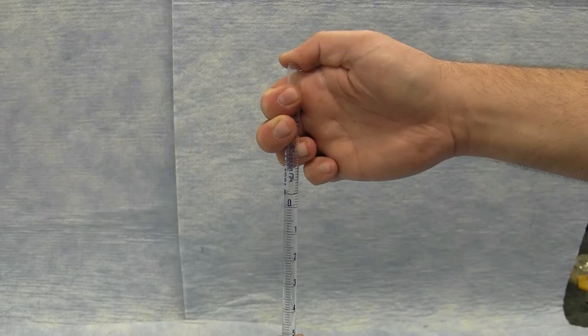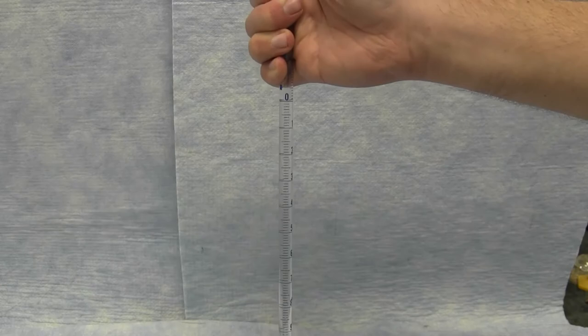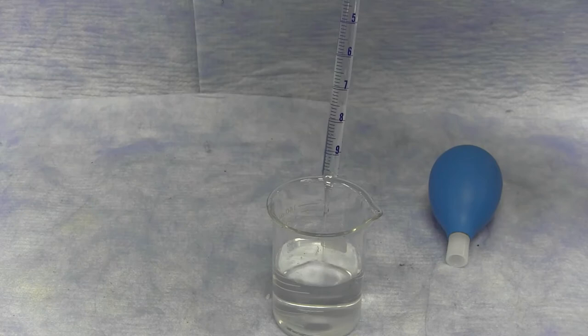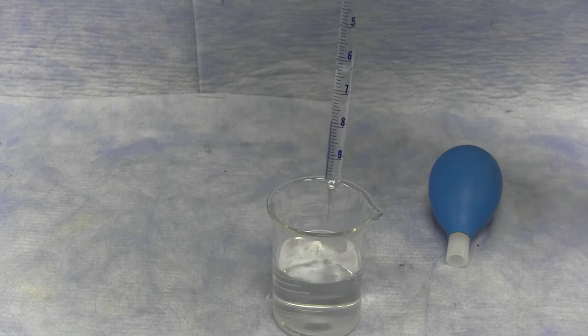You can then transfer the liquid to the appropriate container. As you release the liquid by adjusting the pressure on your thumb, the liquid level itself is going down, indicating that you have dispensed a larger volume to your container.